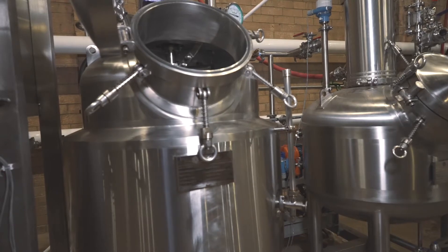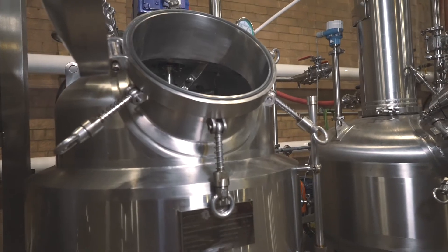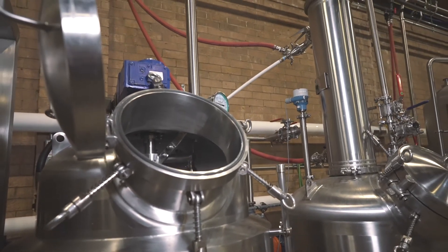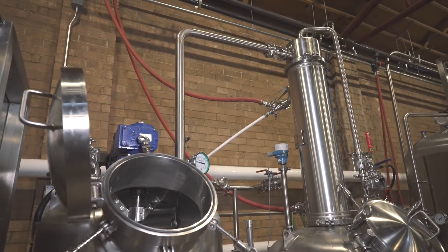This particular Roto EVAP is set to be used under vacuum or at atmospheric pressures, with similar reclamation rates either way you choose. The benefit of running it under a vacuum is it's going to decrease the solvent evaporation temperature, as well as lower the residual solvent levels in the final concentration.